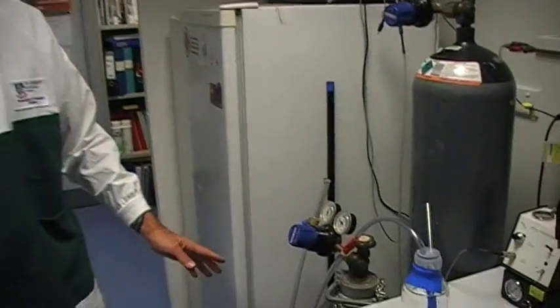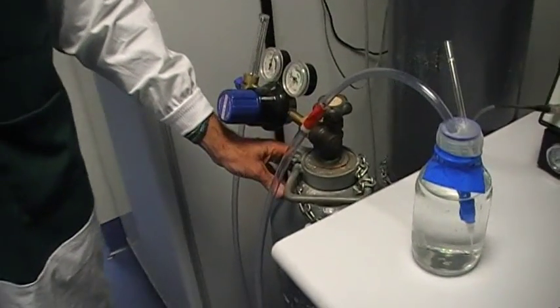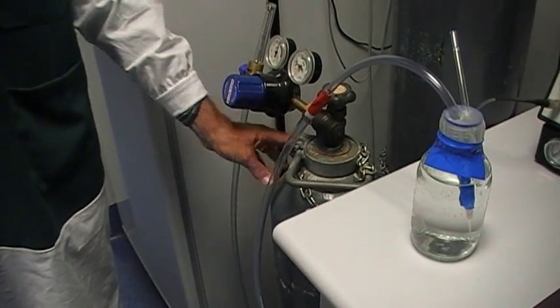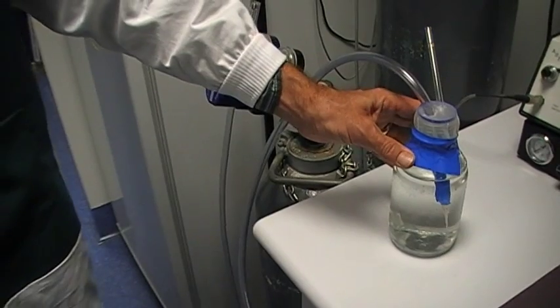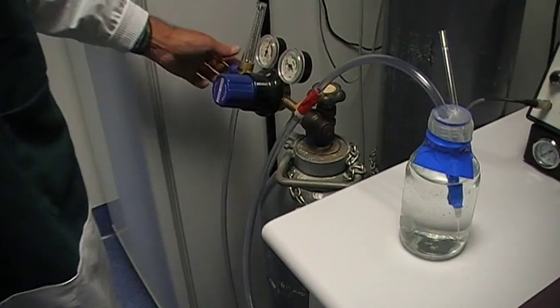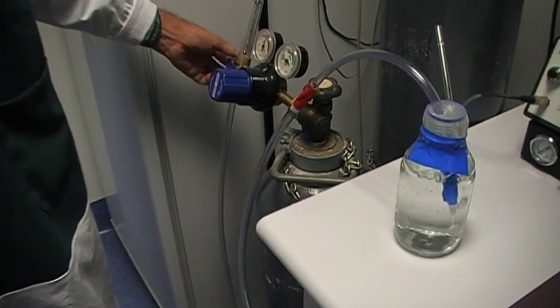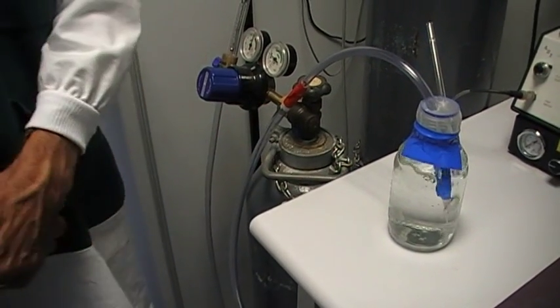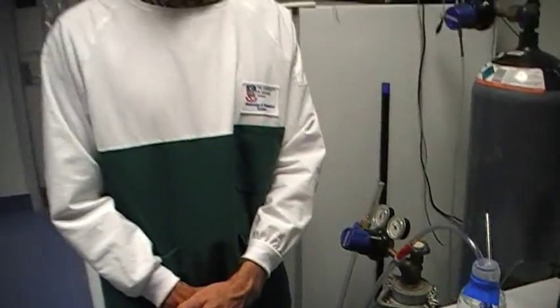So how can we expose zebrafish embryos or adults to low oxygen conditions? One way is shown here. Here is a bottle of nitrogen — this is nitrogen gas with no oxygen present at all. And here you can see a bottle of water that we would place the embryos or the adult fish in. By simply bubbling the nitrogen through the water, we can actually reduce — after a number of hours — the oxygen levels in that water to about one tenth of what they would normally be.